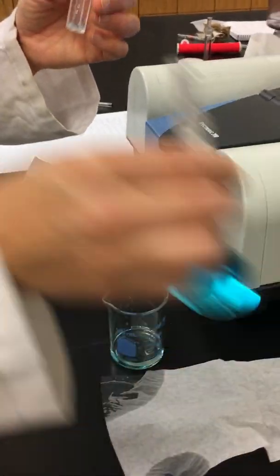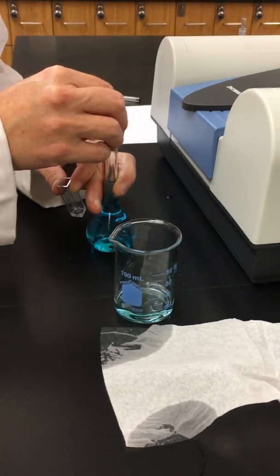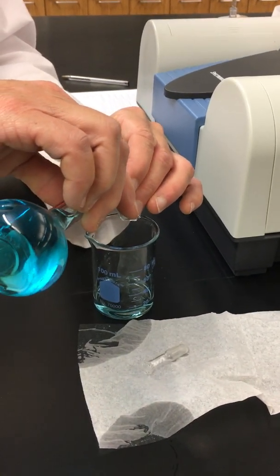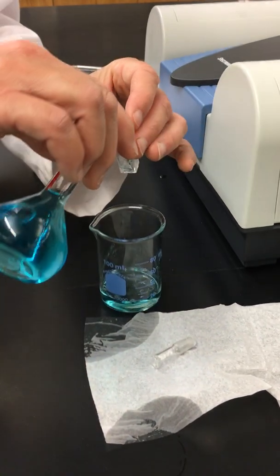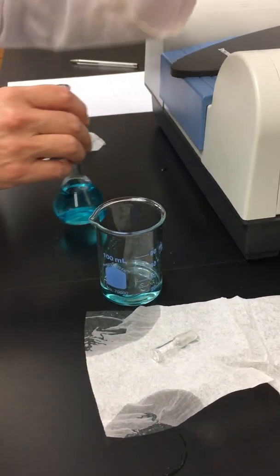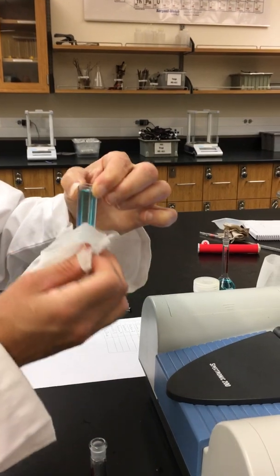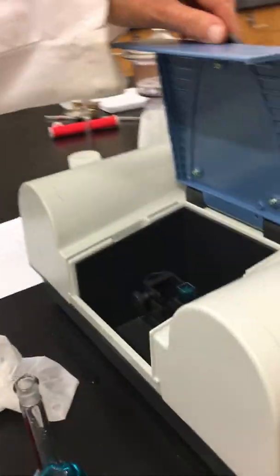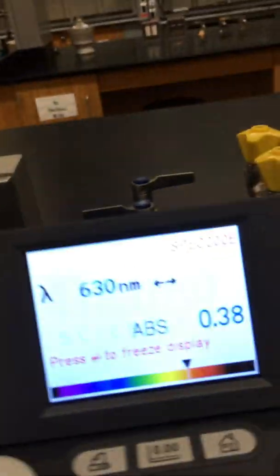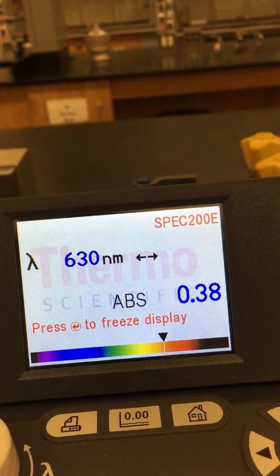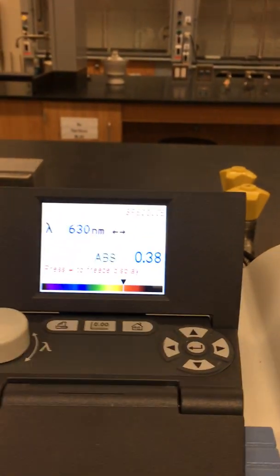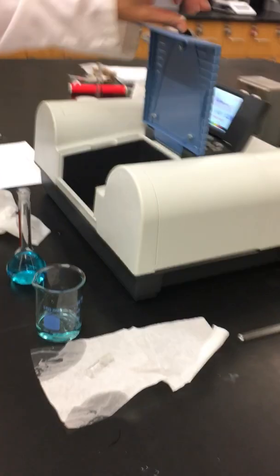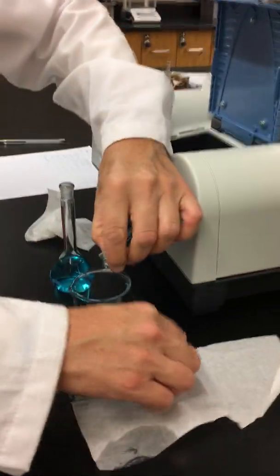Now we have our second solution. But again, we want to make sure we're only measuring the absorbance of our second solution. So we'll rinse out our cuvette with our second solution, and then we'll pour some in. This way we're measuring the absorbance of just solution number two. We'll place this in and record our second absorbance of our solution number two, which is 0.38. Notice our absorbance does not have units.